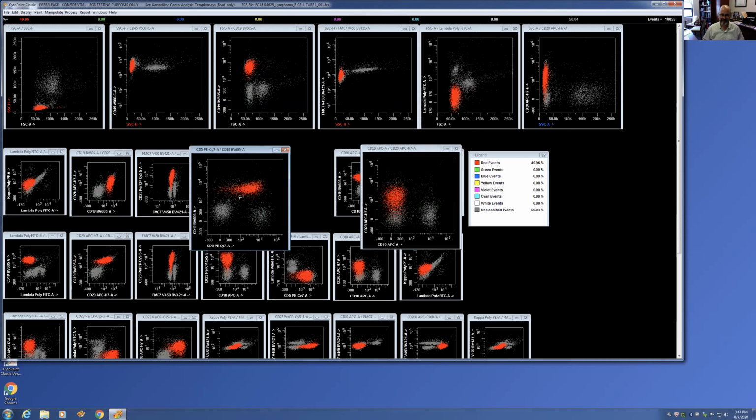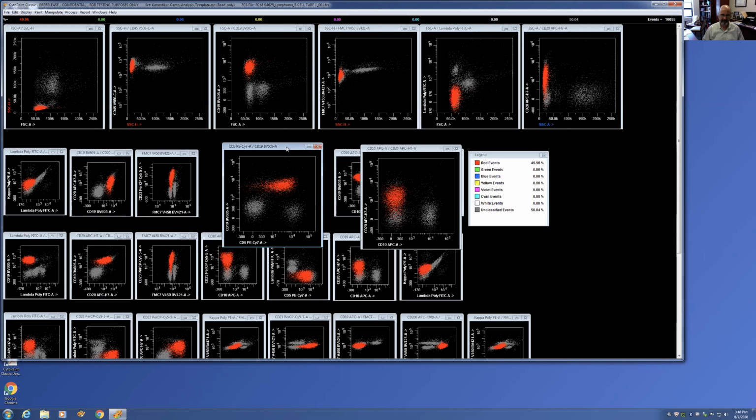But here, so now you have a CD5 positive population that is Kappa restricted. And so what's your differential? It's either a CLL, SLL, right, or a mantle cell lymphoma. What do you look for to resolve that? Well, one thing you can look for is CD23 versus FMC7.